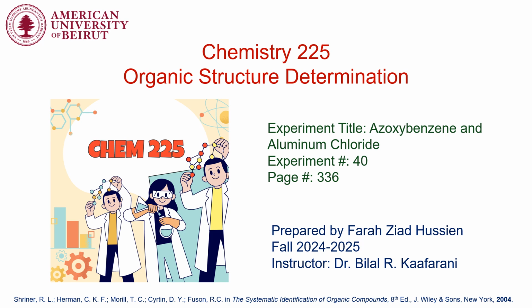Hello, I am Farah Hussein, Chemistry 225 student, and today in my presentation I will present to you the reaction between azoxybenzene and aluminum chloride. So welcome to my presentation.